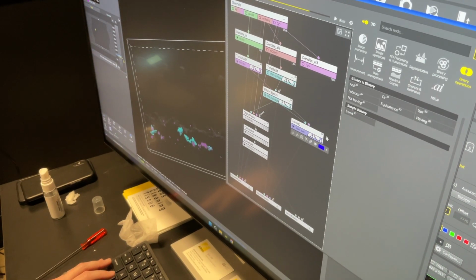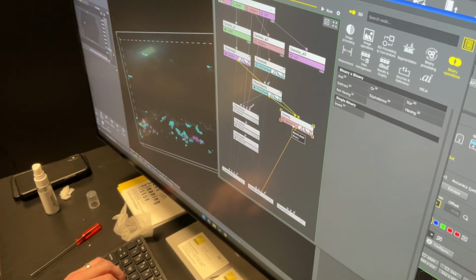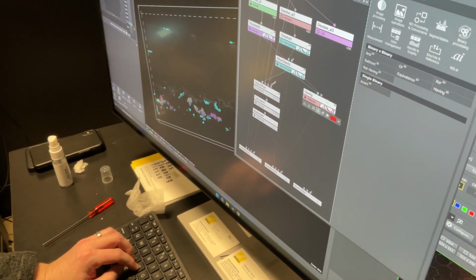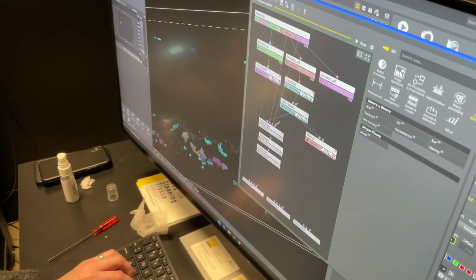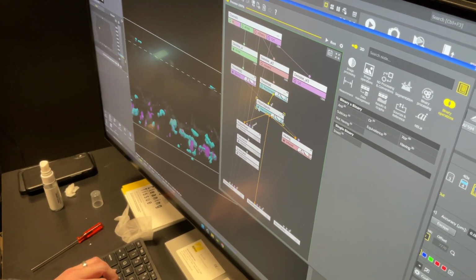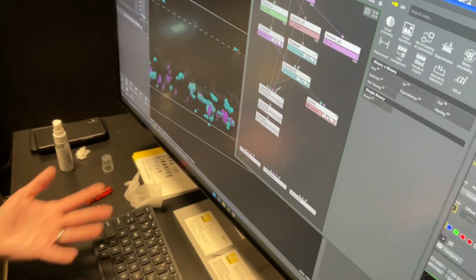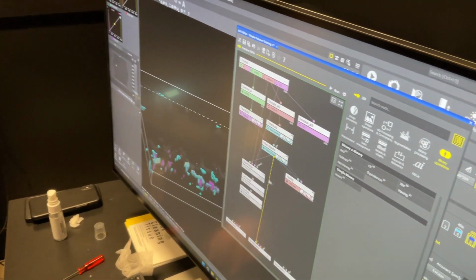So now I can make these red. They're infected. We're gonna make it red, and we'll call this one infected. And now you see I have 3 different layers. And then how you toggle off the other 2 again? Just toggle, right there. It's gonna take a second to render. Right, so based on our current setup, this is what we're getting. And then it's just measuring.